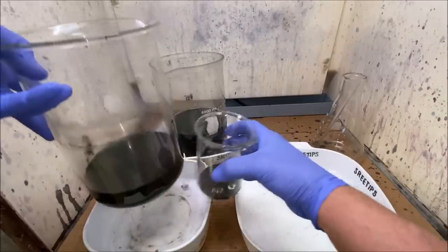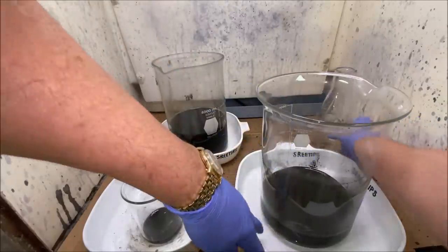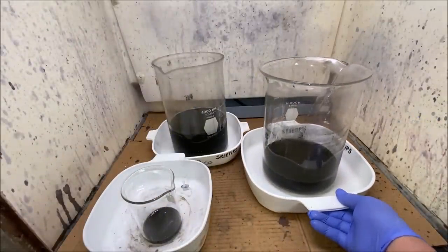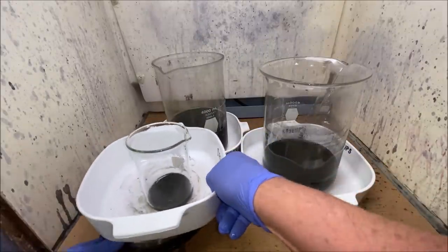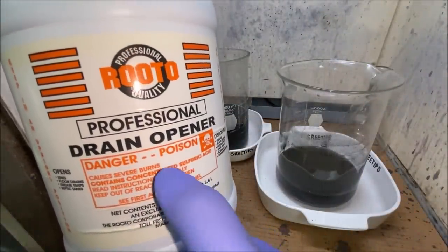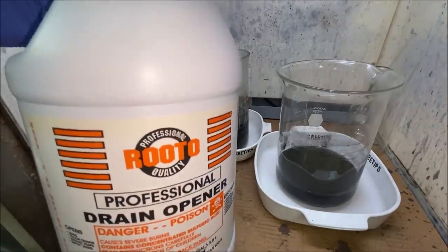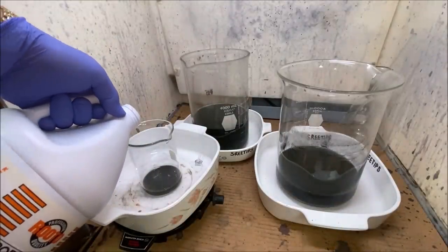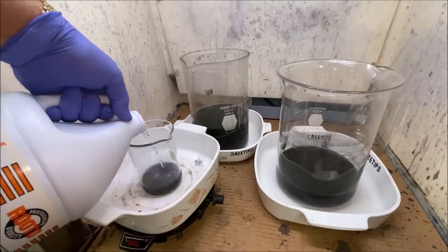All right, let's do a quick experiment here. This out of the way. Bring up our heating pad here. I have some Rooto professional drain opener. It's concentrated sulfuric acid. I'm going to add a little bit of that to our beaker here with our material in it.